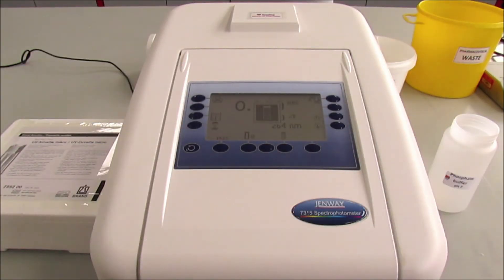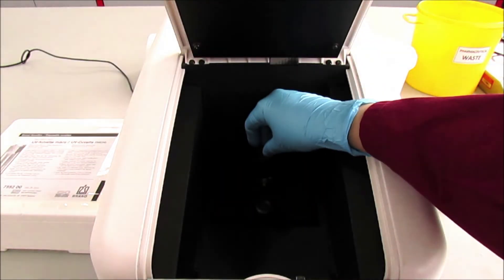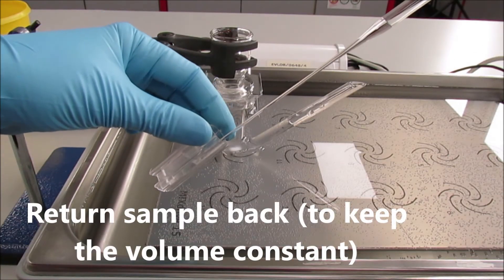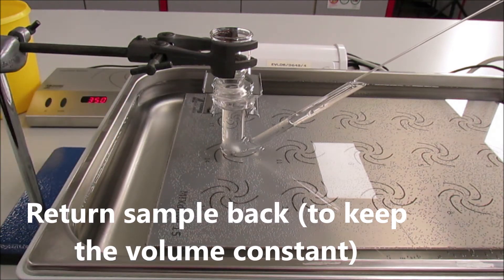First we need to auto-zero the instrument, telling the instrument that nothing is in there. We will auto-zero it with the water taken from the FRANS cell before we charge the FRANS cell with the gel.